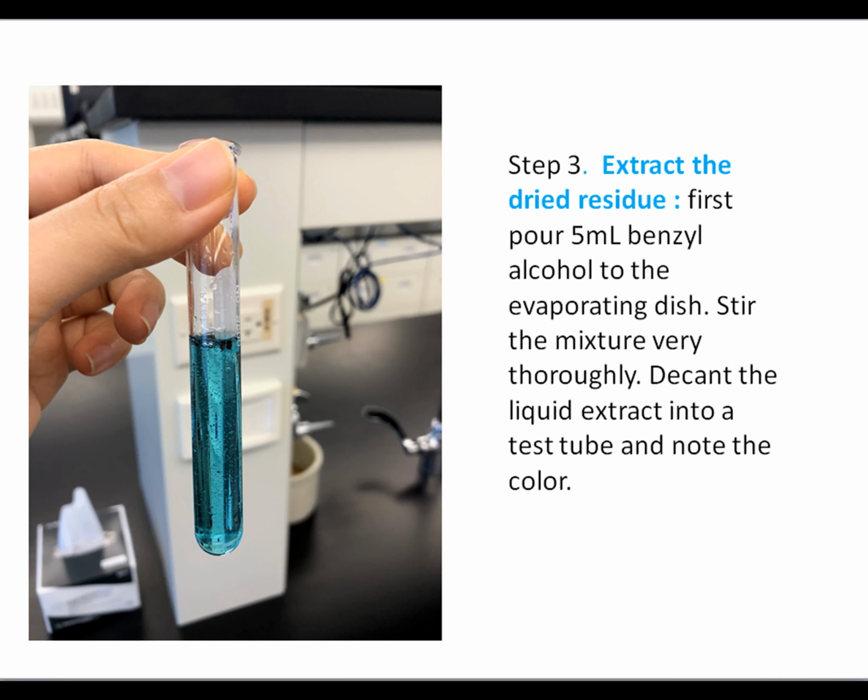Step 3, you're going to extract the dried residue. First, pour 5 milliliters of benzyl alcohol into the evaporating dish. Then stir the mixture very thoroughly. And then decant the liquid extract into a test tube and note the color.